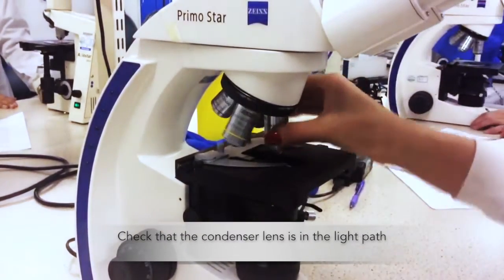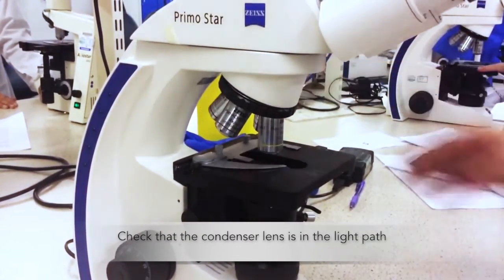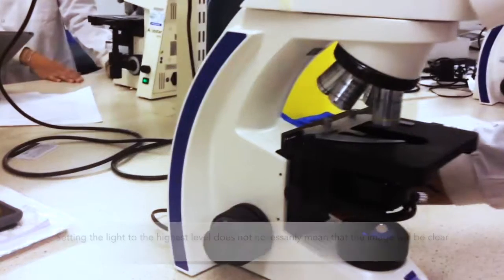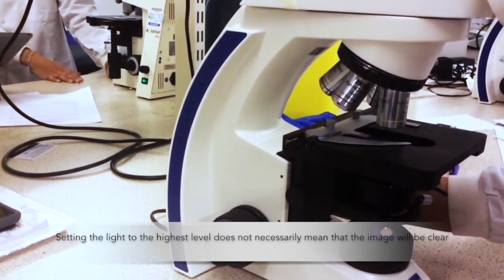Turn the revolving nose piece and select the x10 objective. Adjust the light source to a comfortable level using the light rheostat.